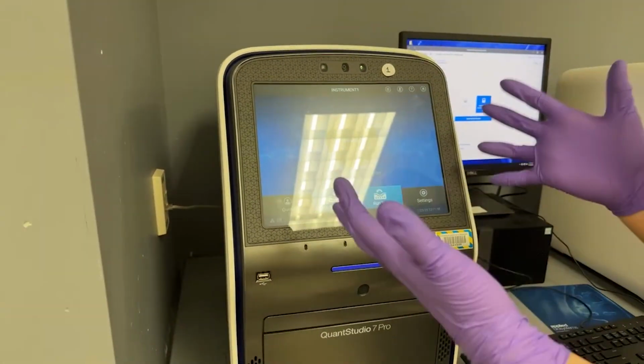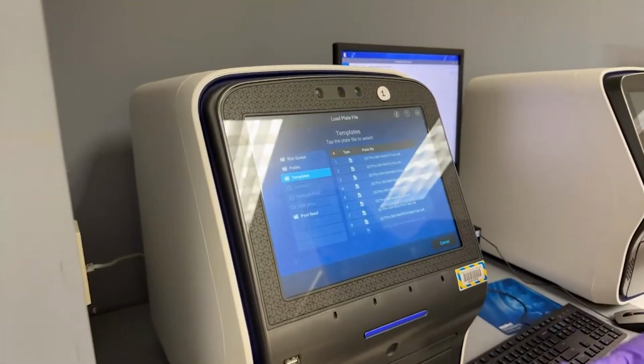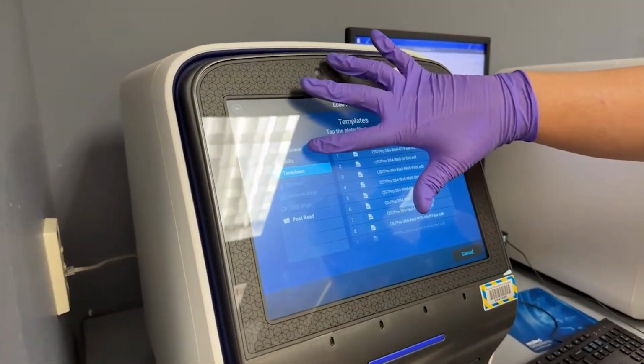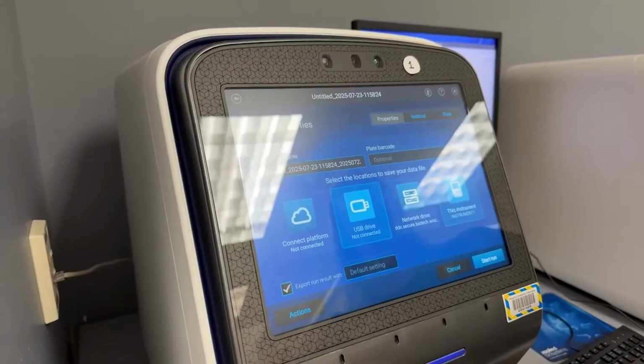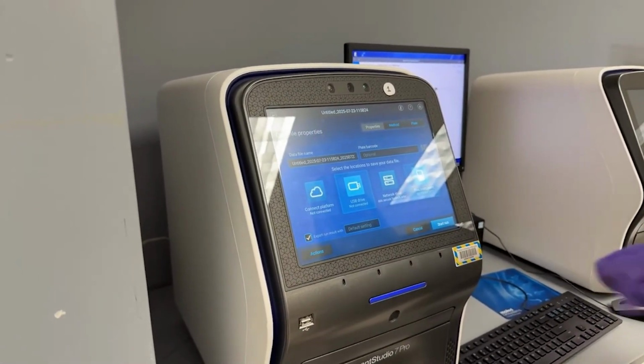All right, there's a great big button in the middle of this screen, and that's what we're going to use. We click Setup Run. And now, remember on the local computer, I sent it to the Run queue. So now I select Run queue. And here is that template, which I had untitled. You can always check those names, and they do match.